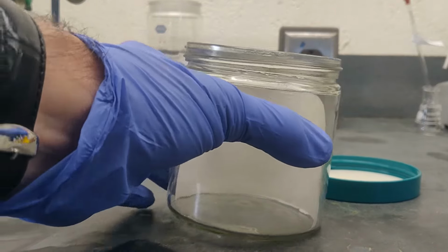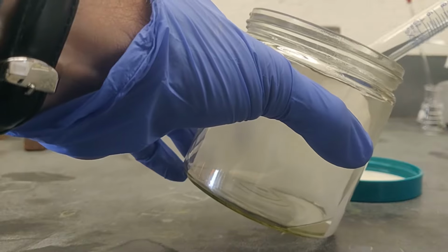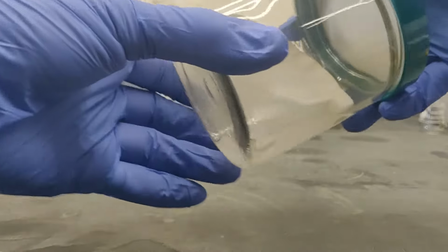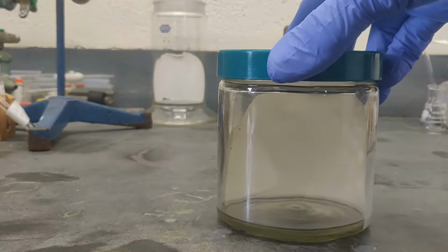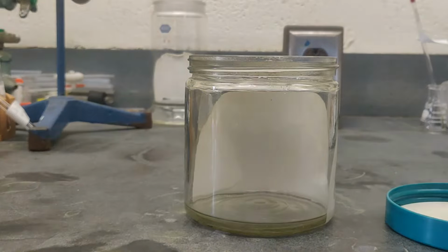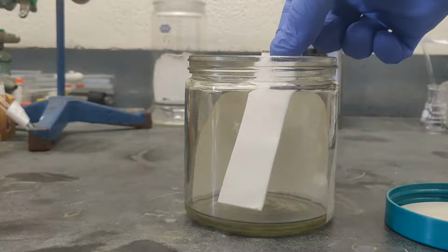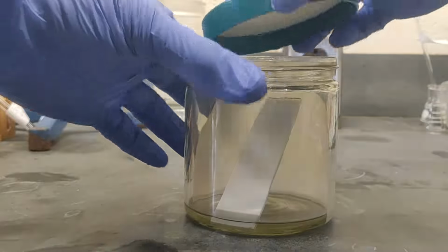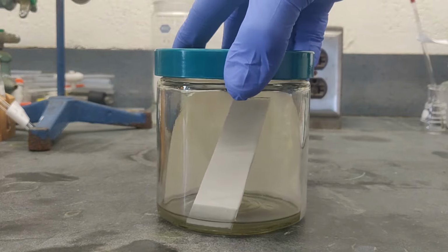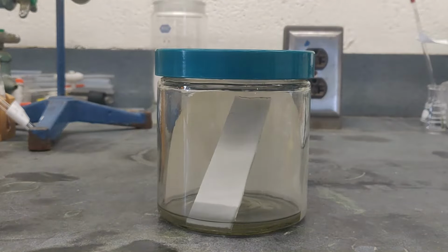Prepare the TLC chamber by adding the appropriate volume of eluent and then wetting the filter paper wick. Use your gloved hand to carefully place the plate in the developing chamber. Position the plate in the chamber such that the top corners are resting against the filter paper wick and the silica surface is facing away from the paper. Immediately cover the chamber with its lid and leave it undisturbed until the eluting solvent reaches the line marked for the solvent front.